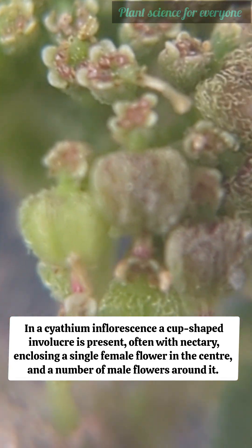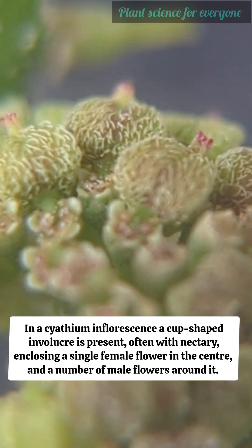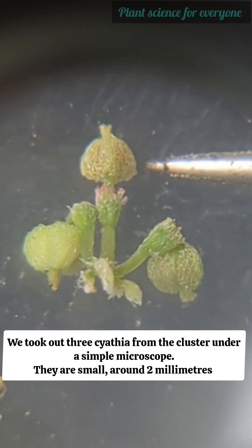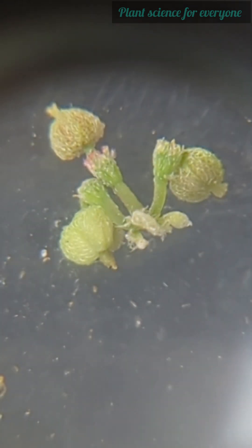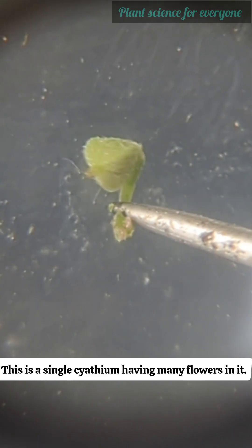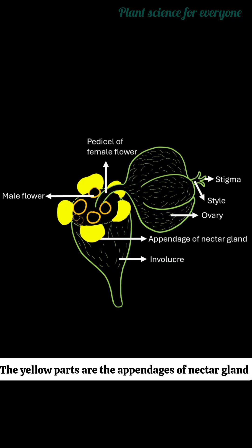An inflorescence is a group of flowers. In a cyathium inflorescence, a cup-shaped involucre is present, often with nectary glands, enclosing a single female flower in the center and a number of male flowers around it. We took out three cyathia from the cluster and observed them under a simple microscope — they are small, around two millimeters.